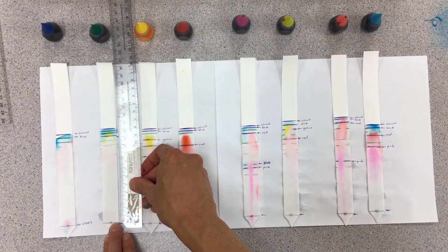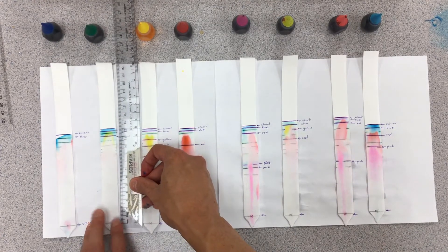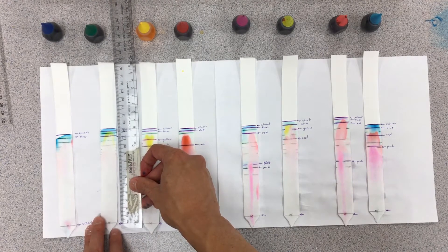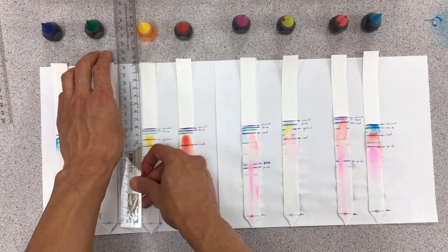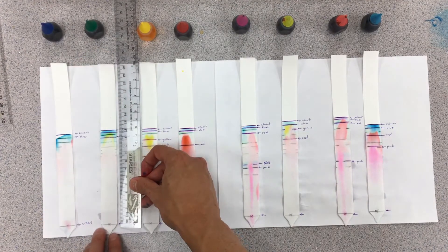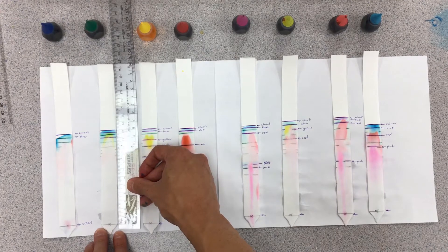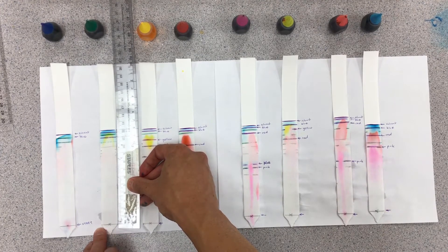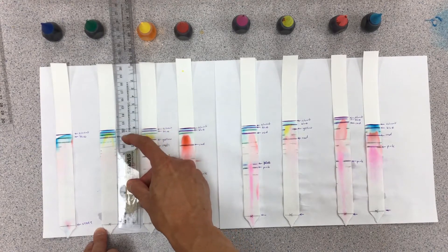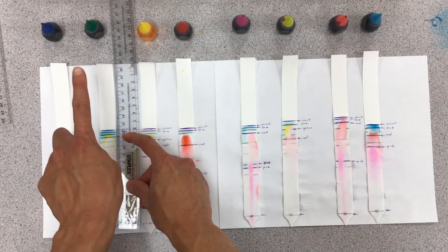I'm just going to prop down this ruler so you can make measurements of the different solvents. Some of these food colorings are actually made out of multiple different compounds. Green is actually made out of blue and yellow, as we can see is separated on this chromatography sheet. About 12 centimeters to the solvent, the blue line is about 11.7, the yellow line is roughly about 11.5.